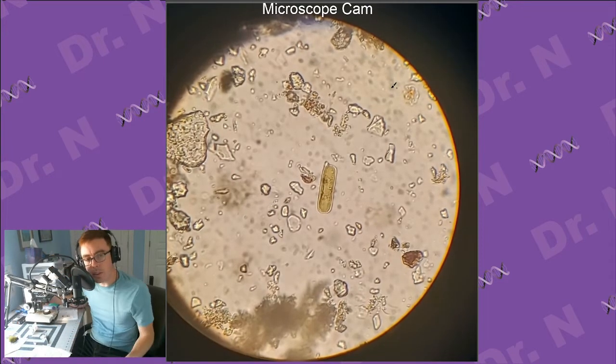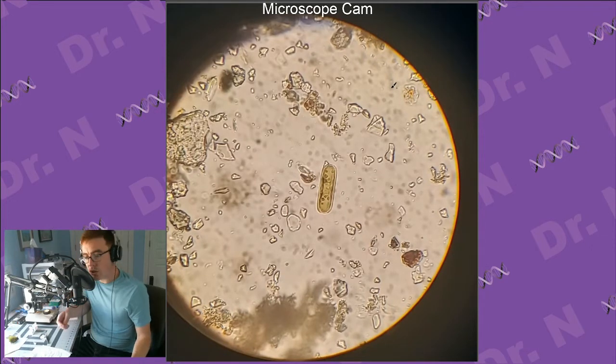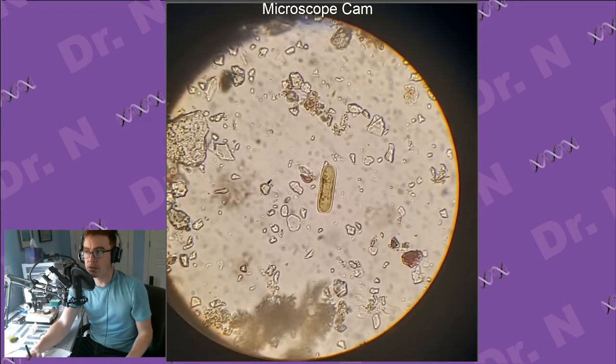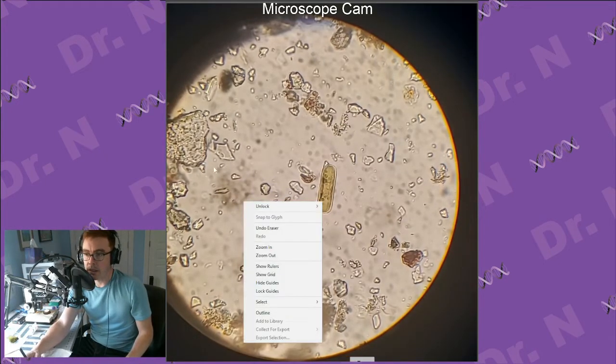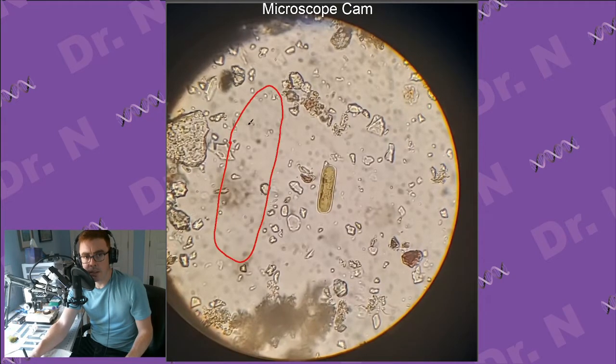Oh, wow. Okay, so this one, it's clearly photosynthetic, and if I sort of go in at about that level, you can see spherical shaped things. Let me just draw more what I'm seeing. Looks about like that. There are some spherical speckles in here of different sizes.